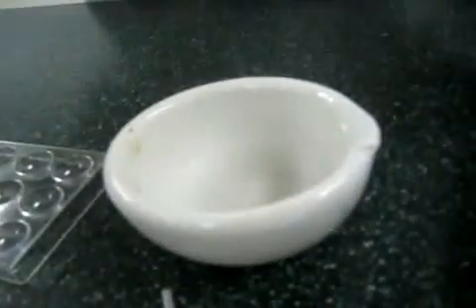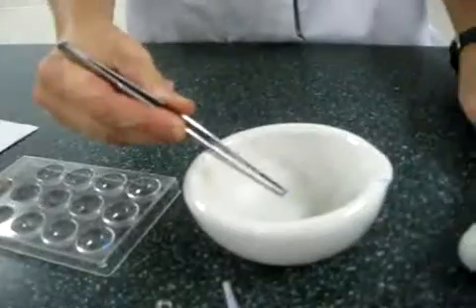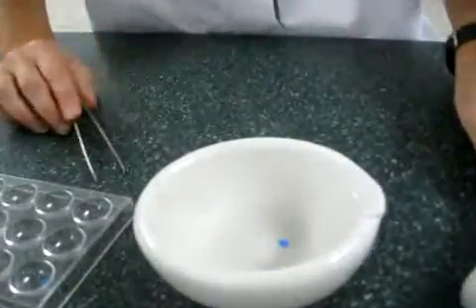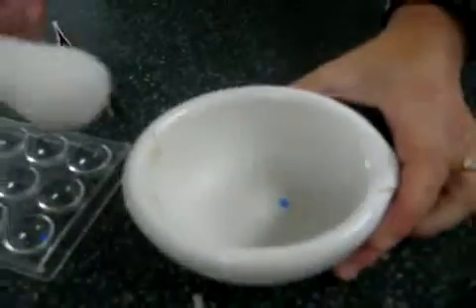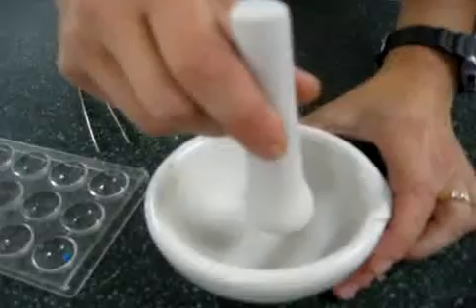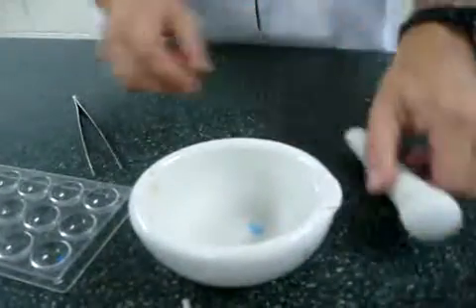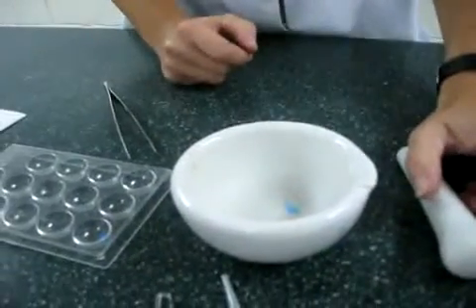You will grab the mortar and pestle and a small sample of your first compound, and you will place it in the mortar and pestle. Then you will take the pestle and you will attempt to tap the compound. If the compound shatters, it is brittle, and you will record that in your observation table.